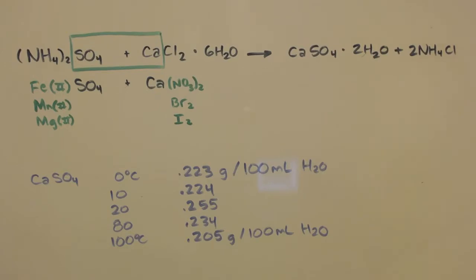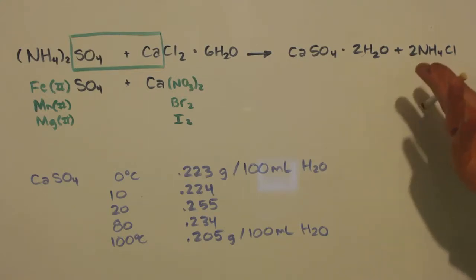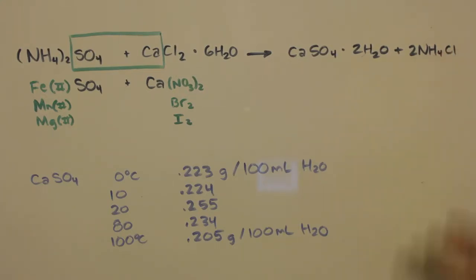Ammonium chloride is soluble, so those ions are going to stay in solution. You can put it in a flat pan and let it evaporate naturally. Leave a little bit of water in there so it soaks up the impurities, filter the crystals out and wash them a little bit with water, and you've got pure ammonium chloride.